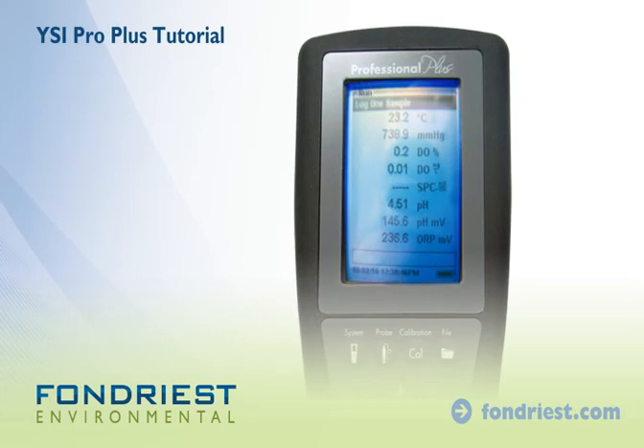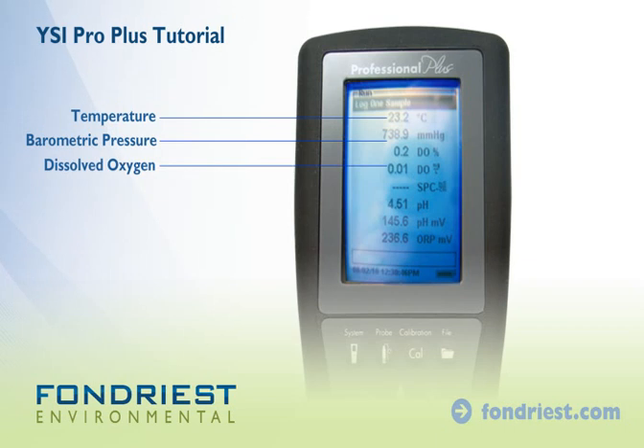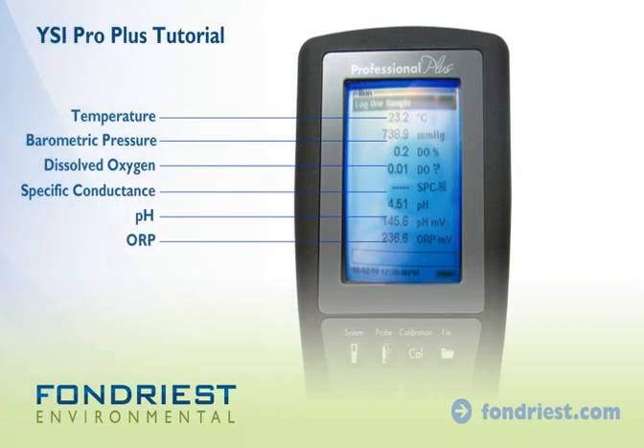By default, the meter will display temperature, barometric pressure, dissolved oxygen, specific conductance, pH, and ORP. Date and time are also displayed.